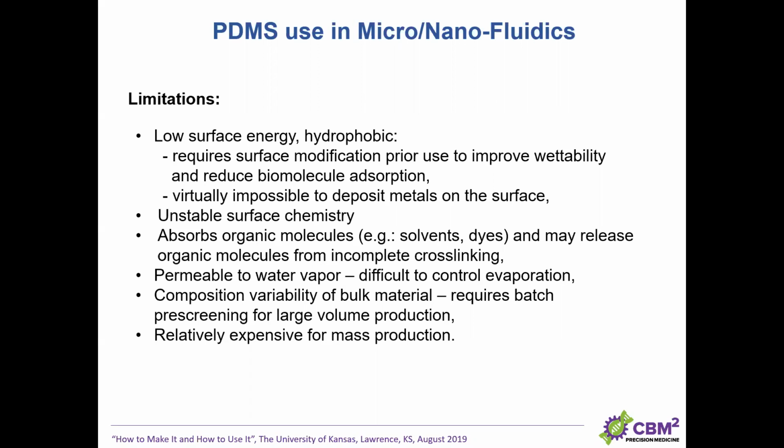It has relatively unstable surface chemistry, and Matt Jackson will cover it tomorrow in his talk. We'll talk more about this. It also absorbs organic molecules, mostly solvents and dyes, that can then leach out later from the material. It may also release some of the organic molecules due to incomplete cross-linking, which may pose some biocompatibility issues.